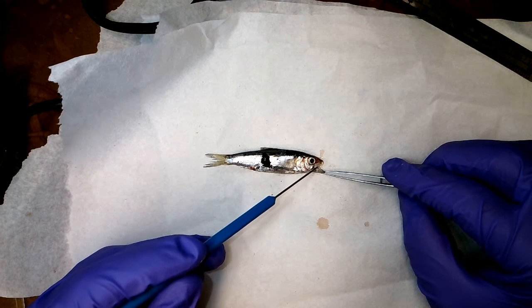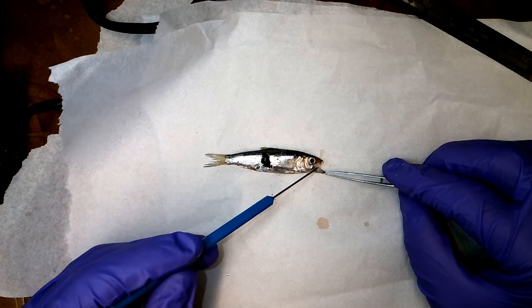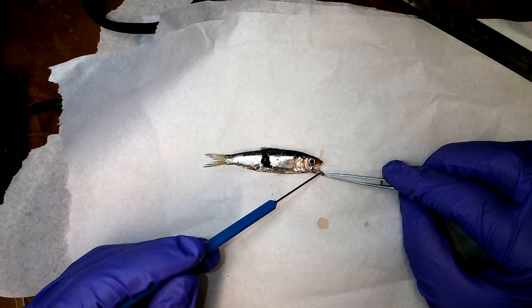Okay, this lower jaw, when I really extend it and pull this out, you can see this profile in the jaw. This is relatively straight.